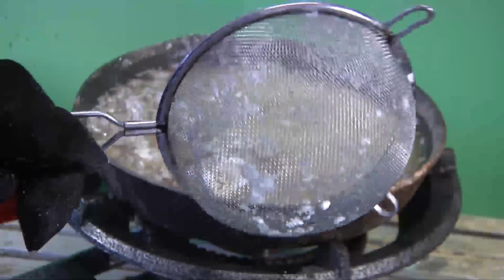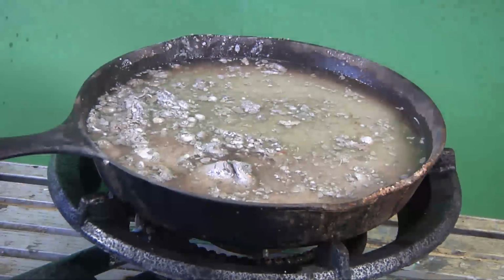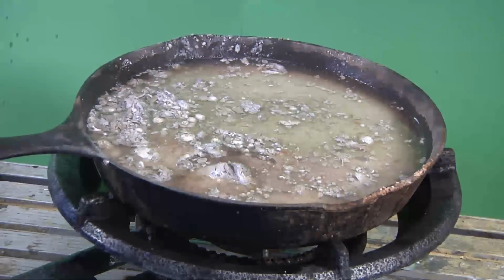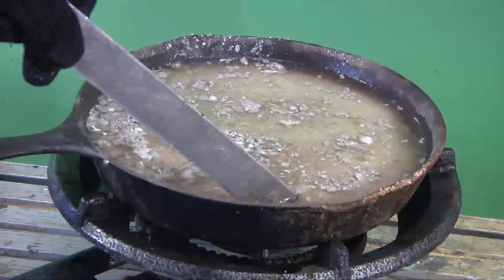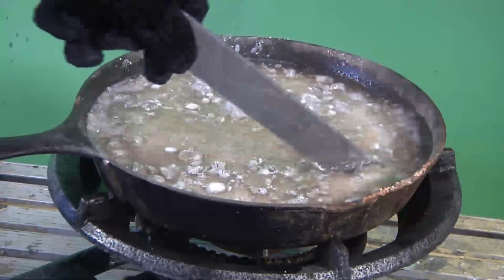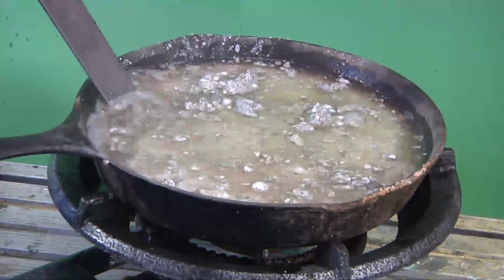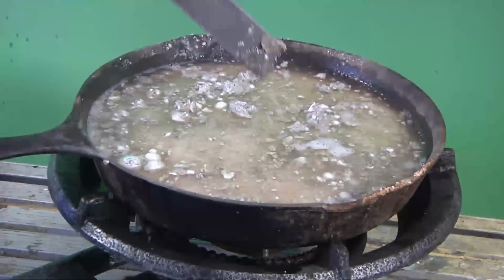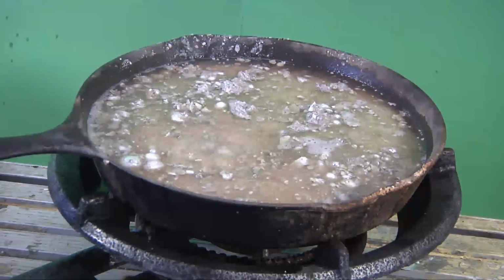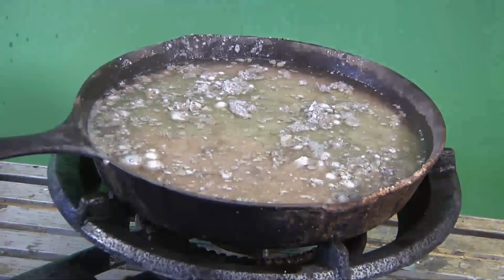So this one's been used, so you know, gotta wash it off before you do that. Or you can do one of my other ways, my favorite ways, which is just take the sodium straight off the bottom. Don't even bother worrying about the contamination, because if it's on the top, then you know where it's at. So what I've got here is I've got a syringe.